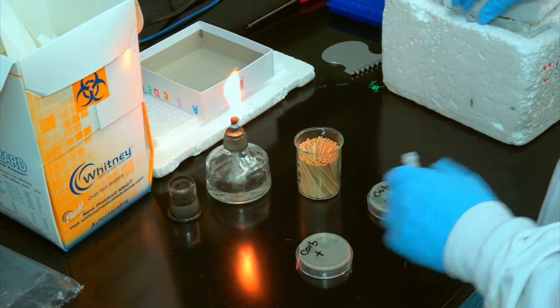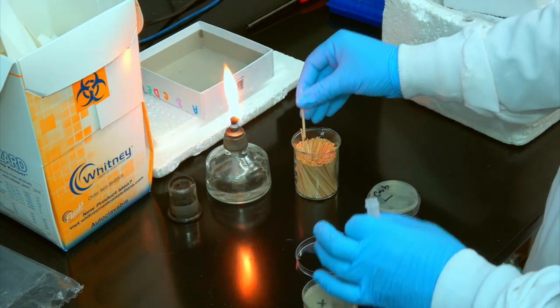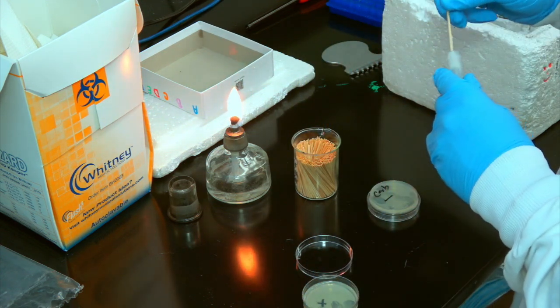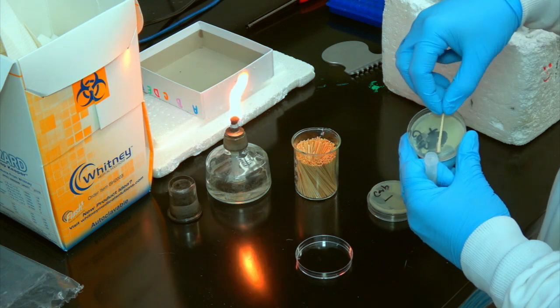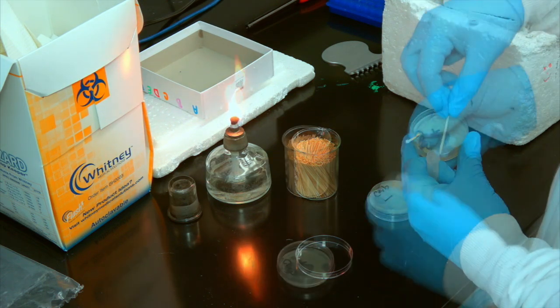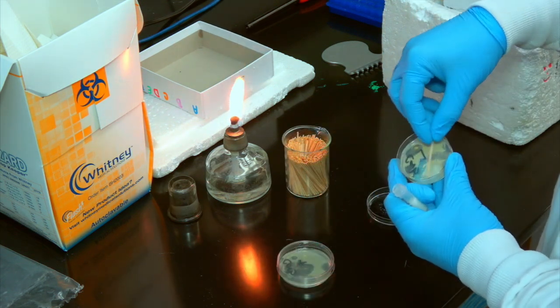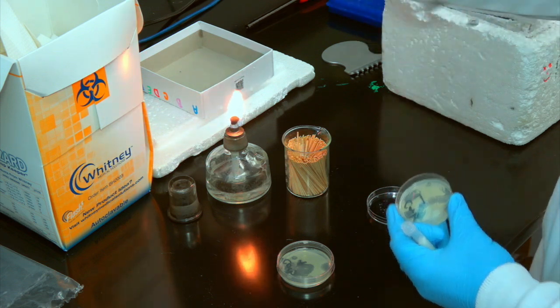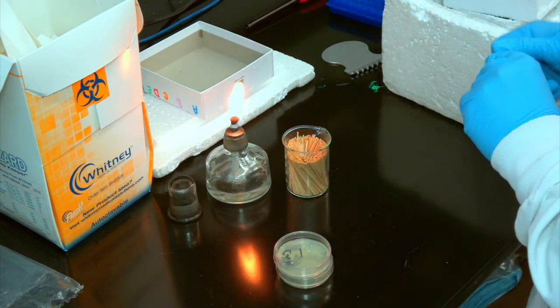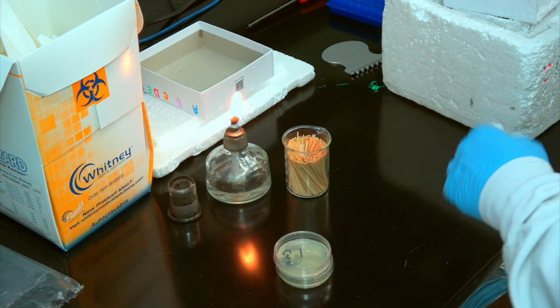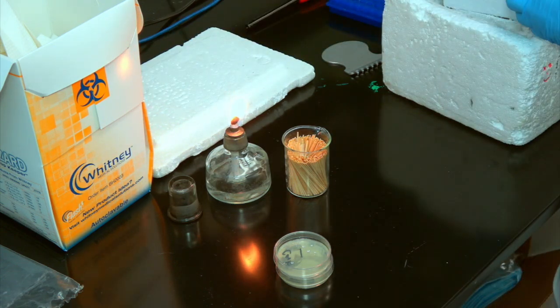Once our plates have solidified and dried, we test them to make sure the antibiotic functions properly. To do so, we pull out two plates. On the first plate, we streak out a strain that we know to be resistant to the antibiotic. On the second plate, we streak out a strain that's not resistant to the antibiotic. We then incubate both plates overnight at the appropriate growth temperature. If we prepared our plates properly, only the resistant strain should grow.